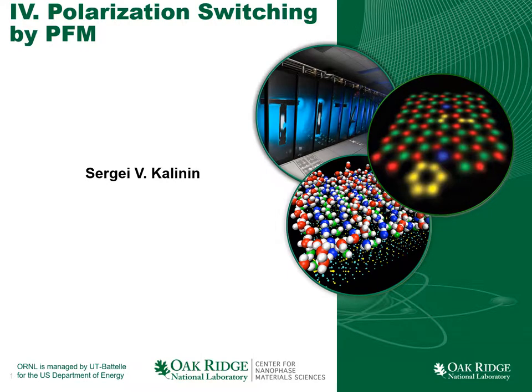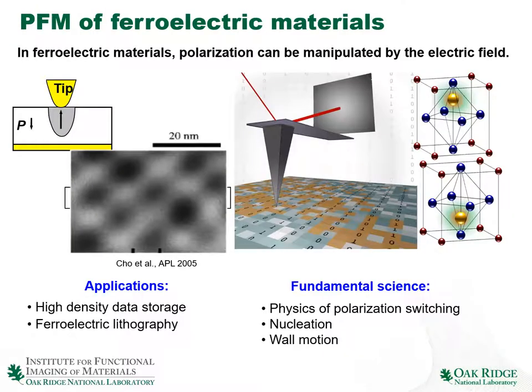In this fourth presentation, we are going to talk about the polarization switching using the PFM. So the big difference between the ferroelectric materials and general piezoelectric materials is that in ferroelectrics, polarization can be manipulated by the electric field. So if you look at this schematic of the polarization oriented downward, we can actually use the scanning probe microscopy tip to orient it upward. And there are quite a lot of reasons why it can be useful.